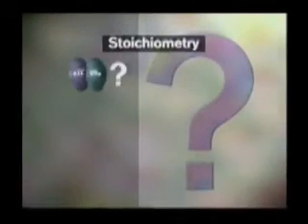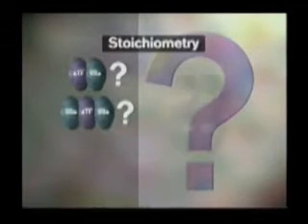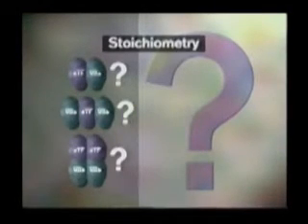To determine the molecular weight of the whole complex, we'll use a different protocol, one that can tell us something about how STF and 7A interact.